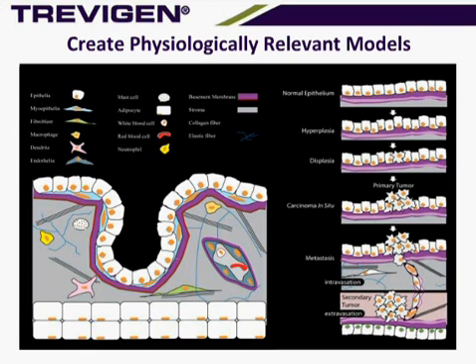Our spheroid models, the spheroid proliferation and viability model, recreates the primary tumor, such as you see in the carcinoma in situ. Then when we look at the spheroid invasion model, it's reconstructing these very early steps in metastasis where the cells are invading out of the primary tumor and into the surrounding ECM.